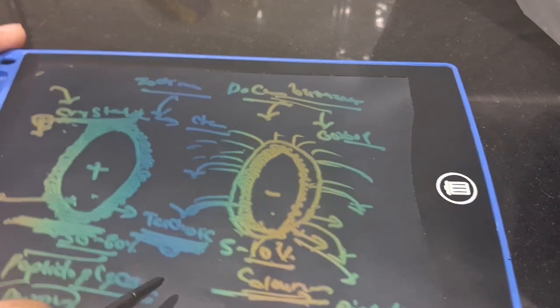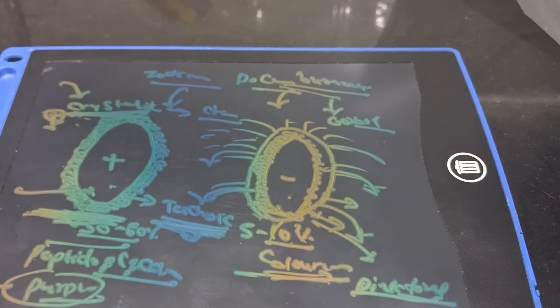So this is the main difference between gram positive and gram negative bacteria. In this video we have explained the full principle, how the reagents work, and what the key factors are that you need to remember.